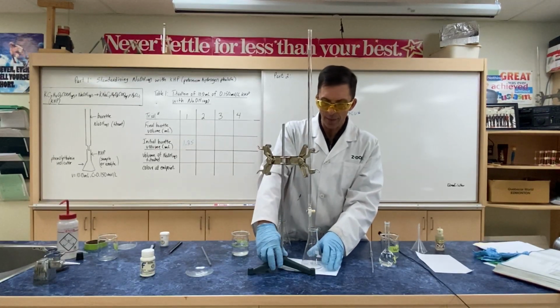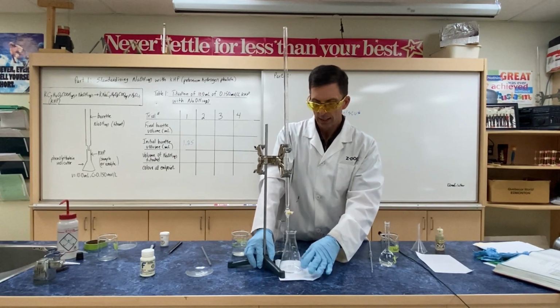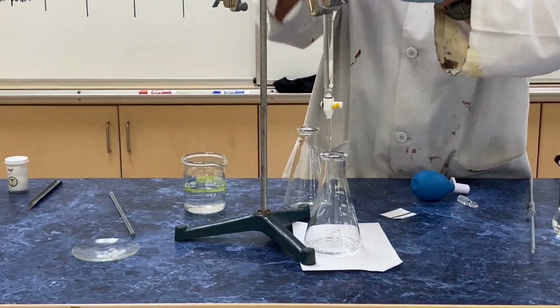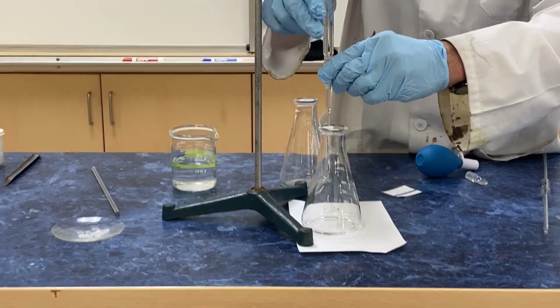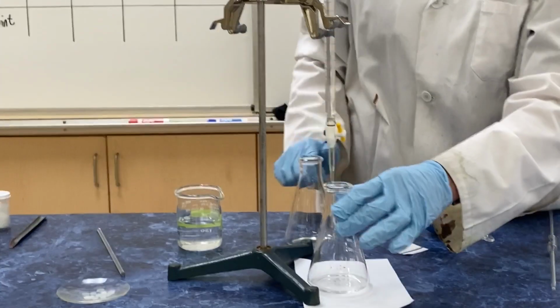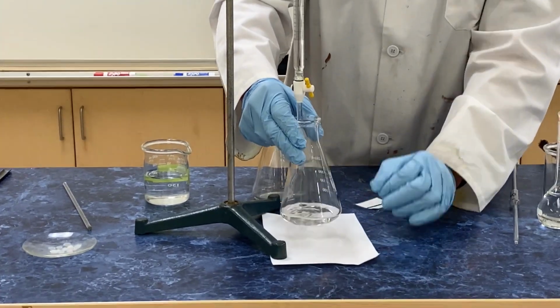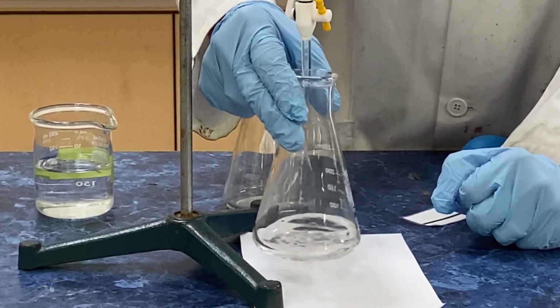Notice on the lab bench I have a white sheet of paper to serve as a background to better identify our indicator endpoint. Because without that, you would see kind of blue, really. We are mixing the solution, swirling by hand. Sometimes in our lab we'll use a magnetic stir. Those are always a big hit.